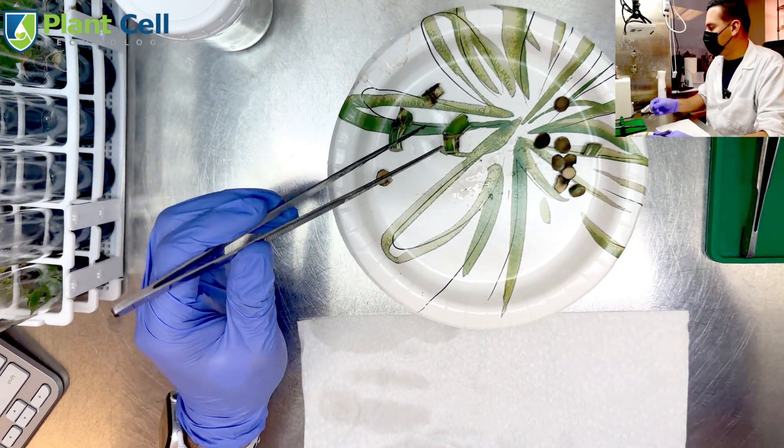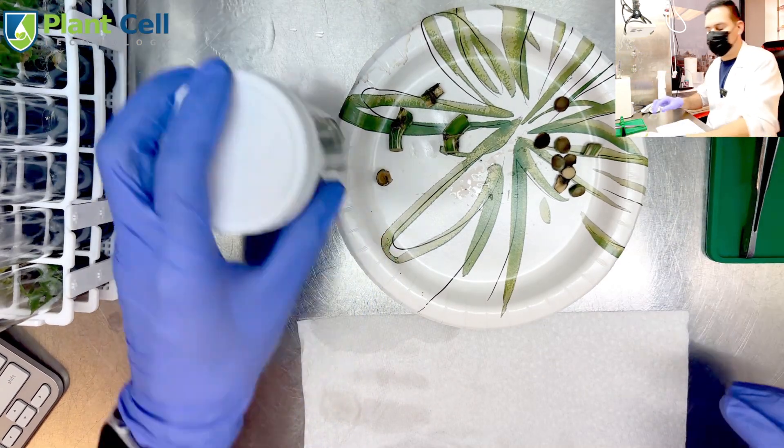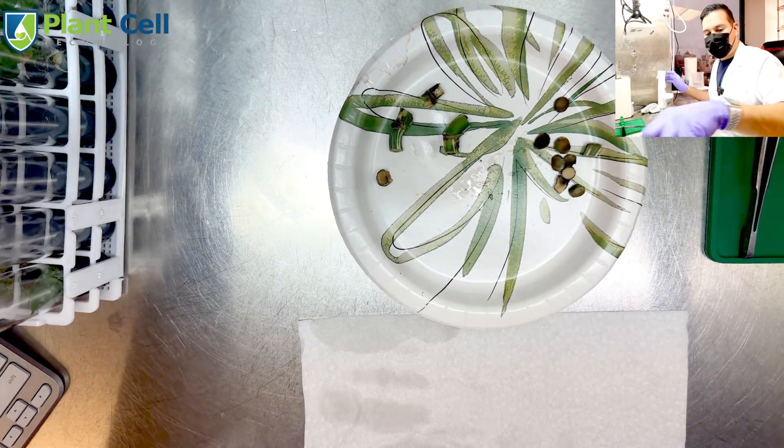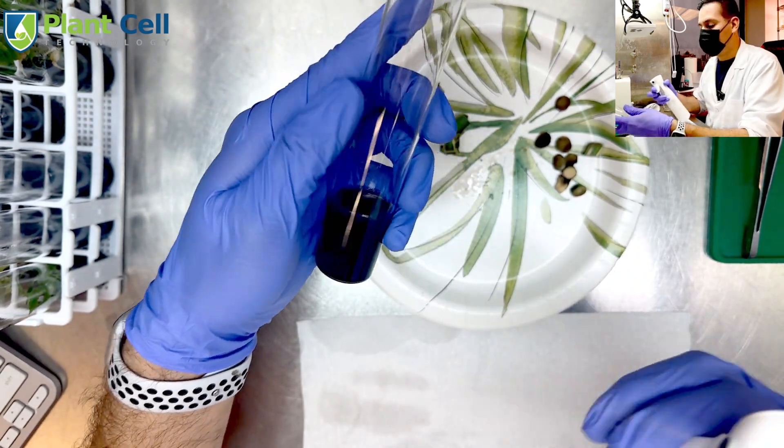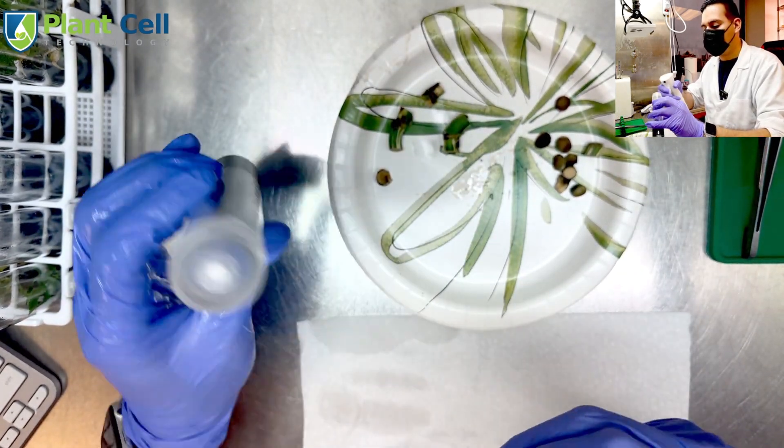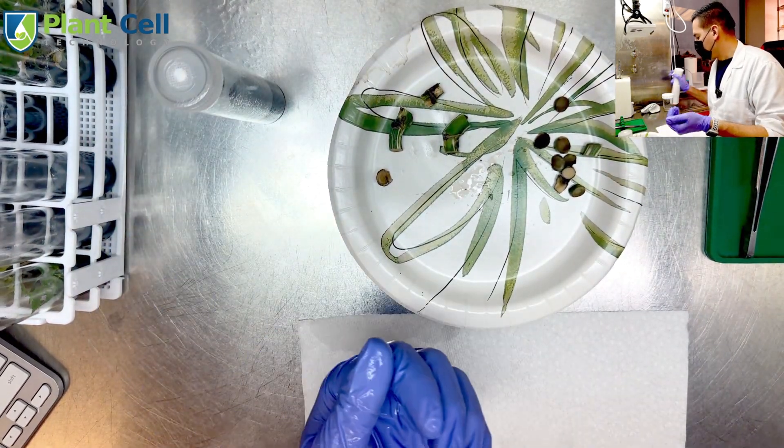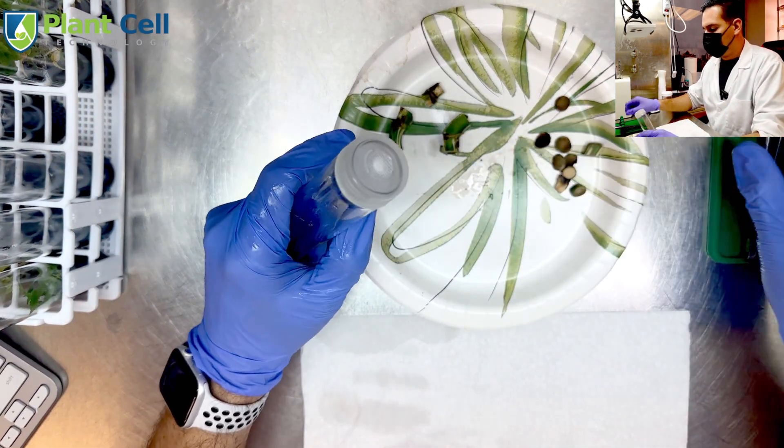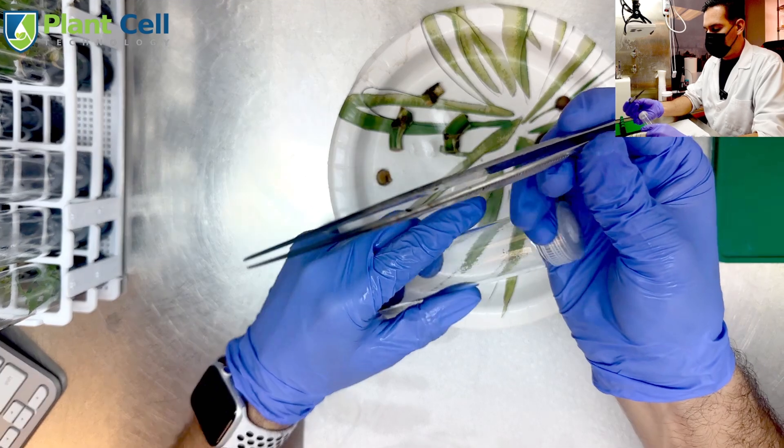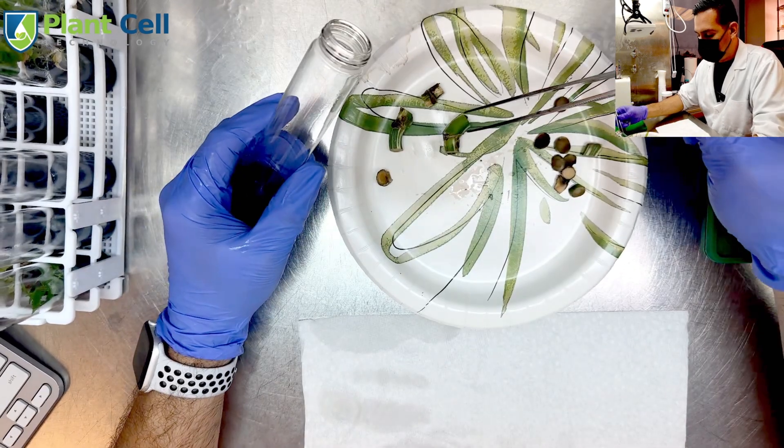There we go, I have my four cuttings sterilized. I want to take my test tube. This media is just MS media but it has charcoal on it, so it can absorb some of those phenols. I'm going to take my plants.